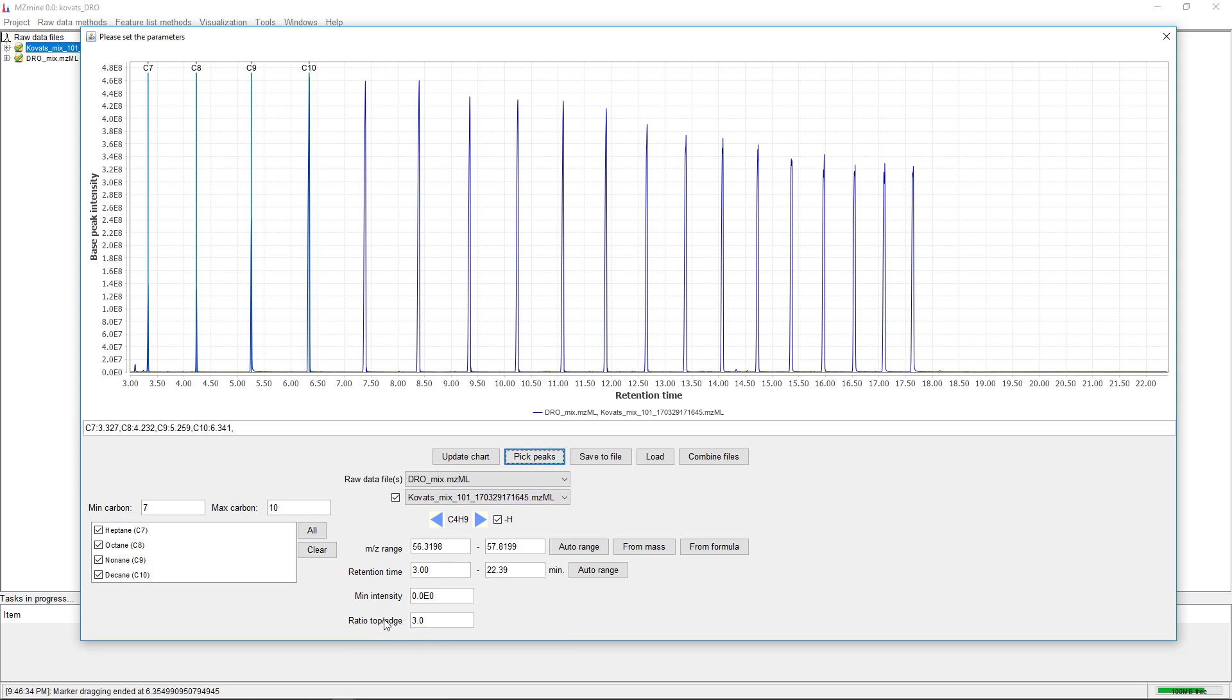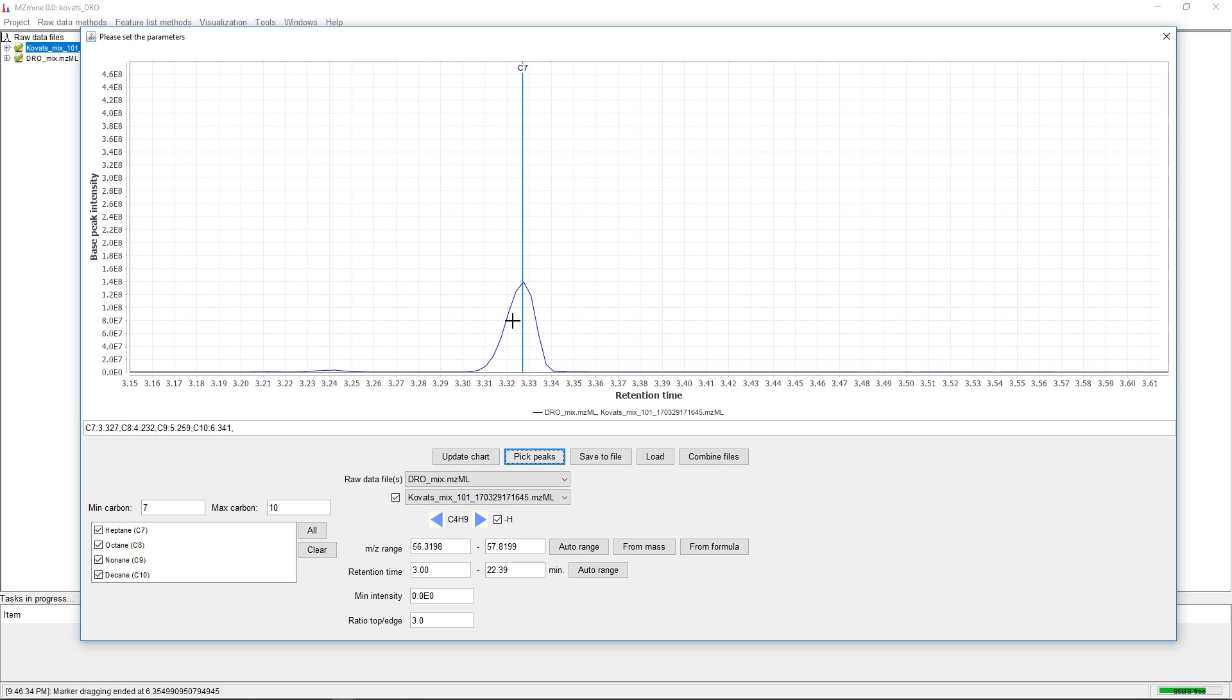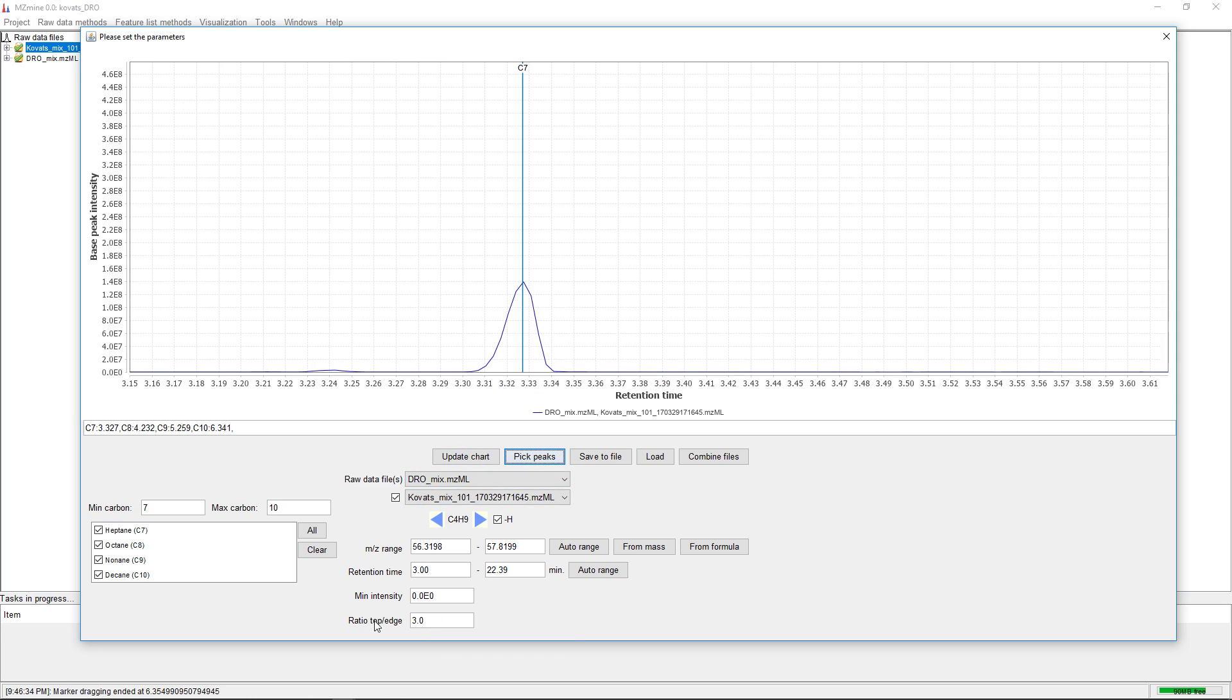Then we have the ratio top to edge. By zooming in, we can see we have a nice peak shape with the top here.